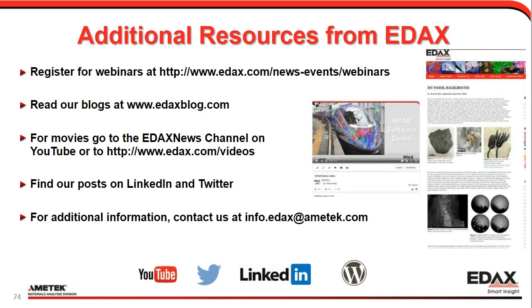There's a question about biological materials and performing EDX on them, but I would assume EBSD. It's difficult. There have been a few results. The key that we have found is to get your system all focused in one area, and then when you want to do your EBSD, not even worry about indexing.